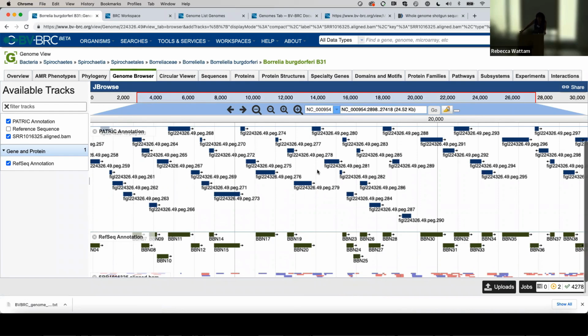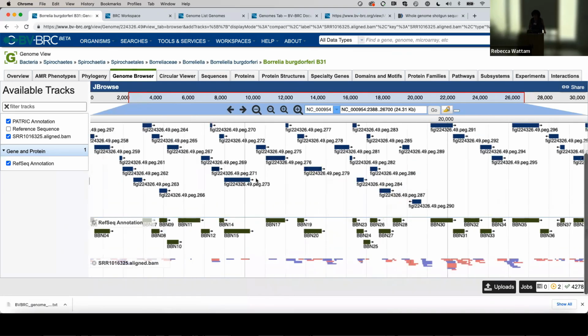I used to get excited too, until I clicked on the browser. And then I thought, oh, maybe this stinks. But I wouldn't go that far. But that's why all the knowledge is there at your fingertips for this. Look at that. So sad how few reads there are to some of these things.